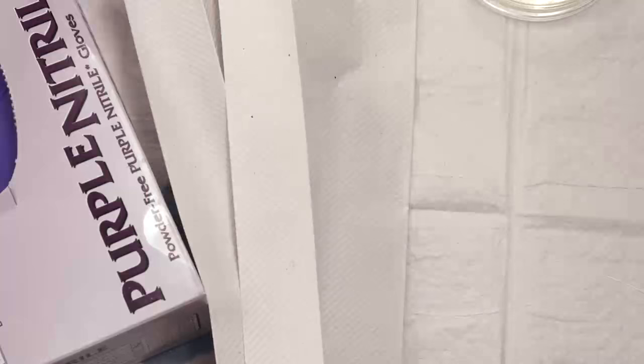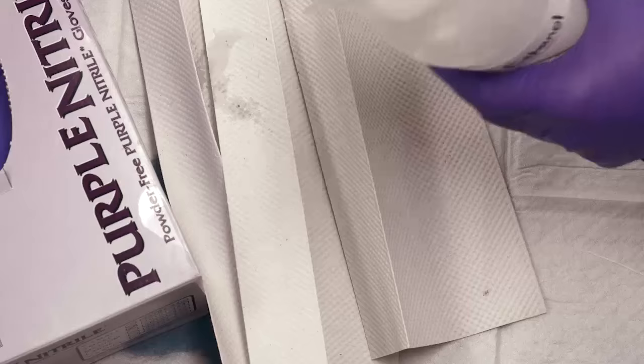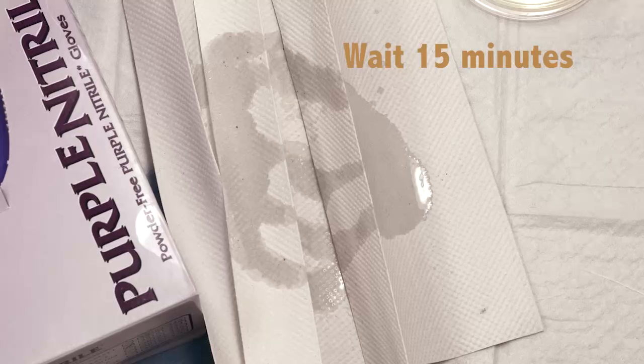Immediately cover spilled cultures or broken culture tubes with paper towels. Saturate the area with disinfectant solution and let it sit for 15 minutes. Notify your instructor.